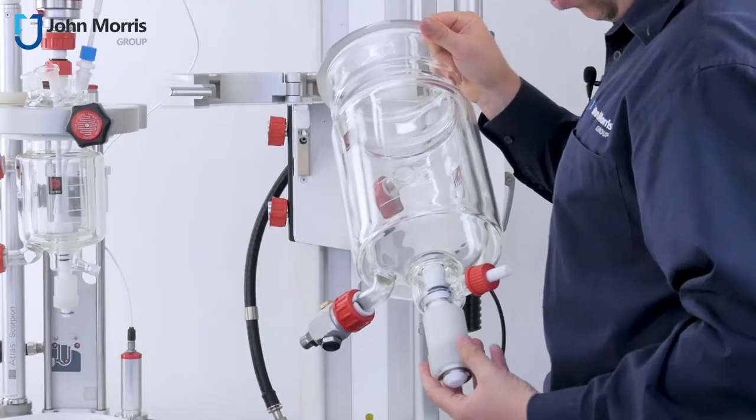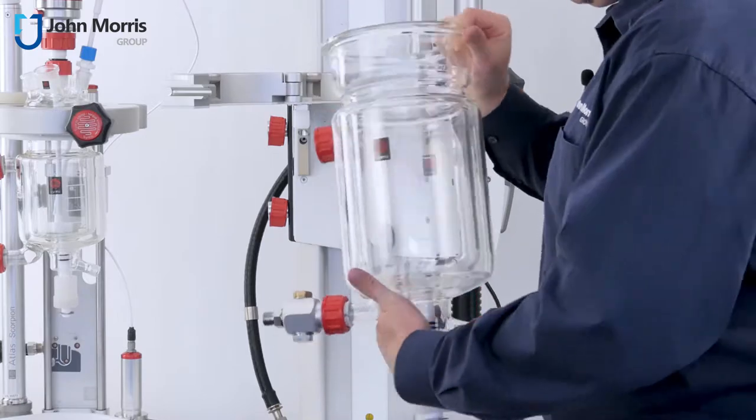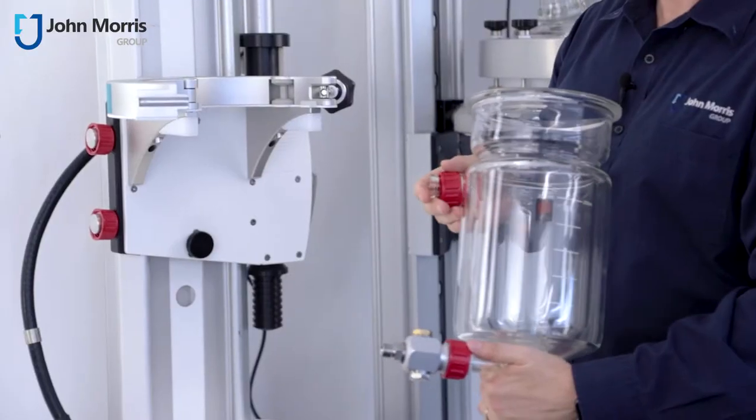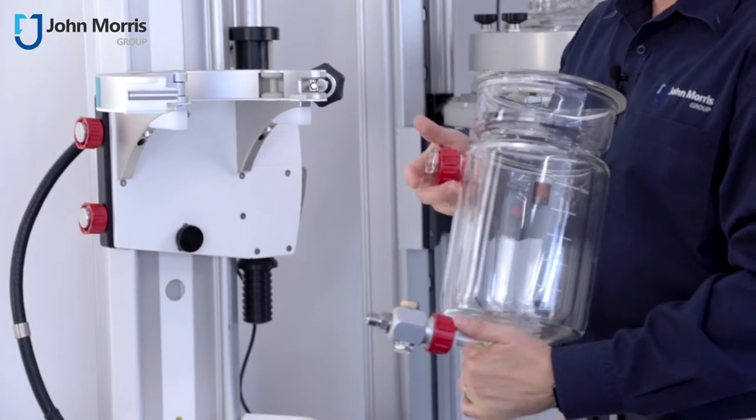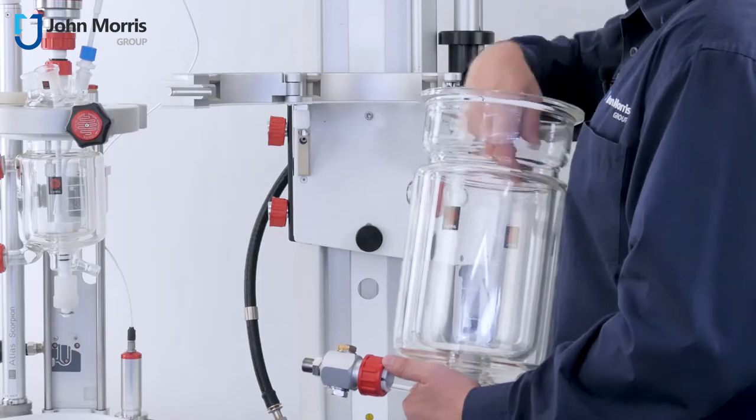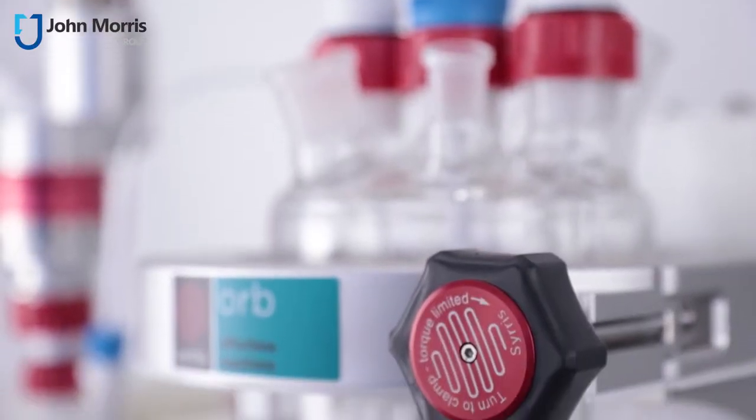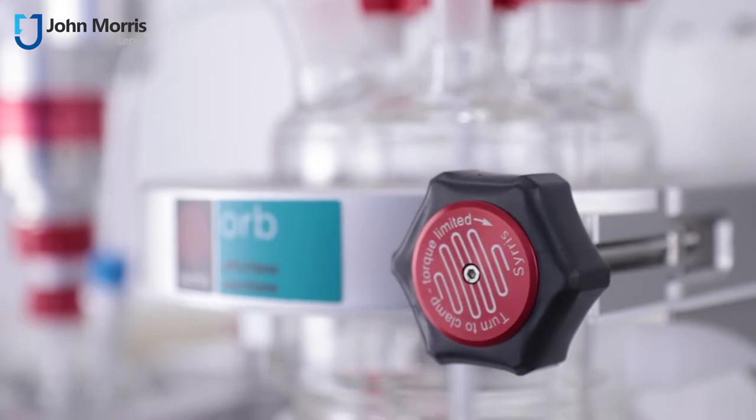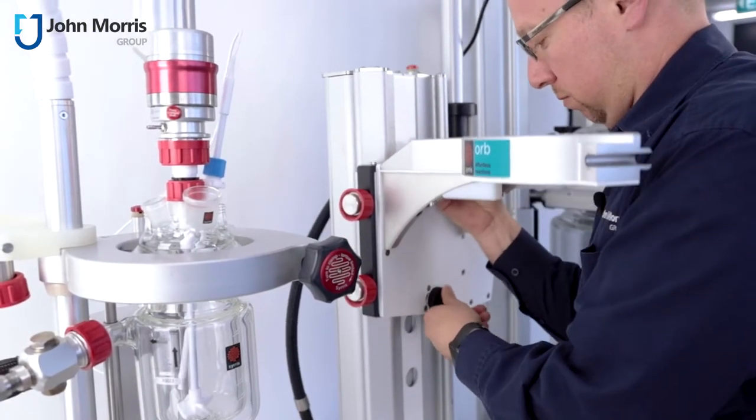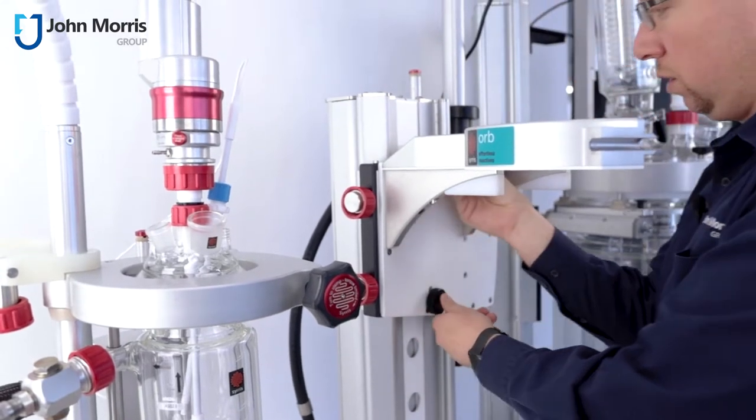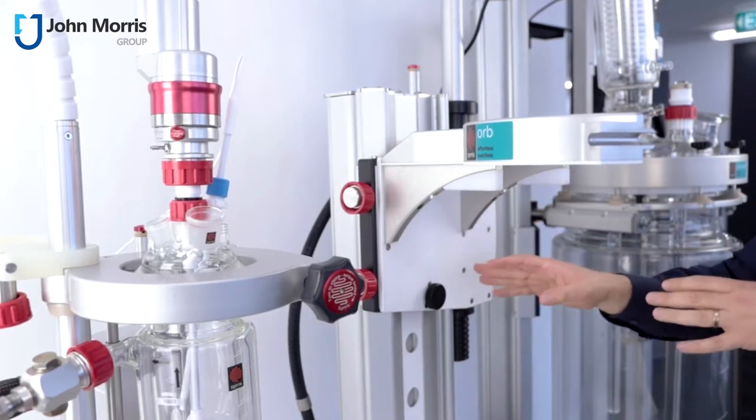Again at the bottom of the vessel you have the same ratchet design that enables you to drain the vessel without having to remove it or without having to disconnect the ports that enable the jacket to have the cooling or heating fluid circulating around the actual internal section. Now what I'm going to do is I'm going to show you how easy it is to adjust the height of this particular unit so you can put on a smaller or a larger vessel. Lifting it like that enables you to put up to a 10 liter reactor in place.